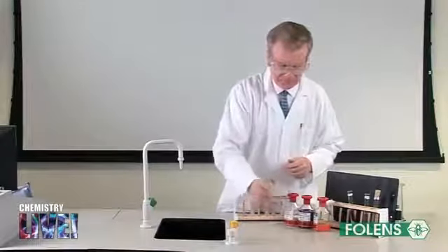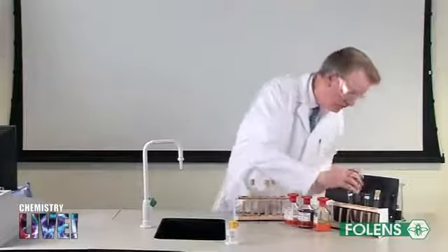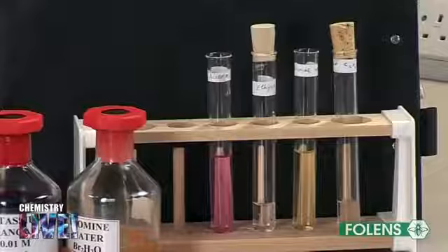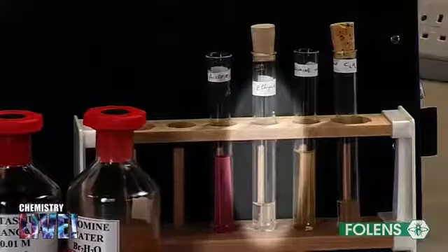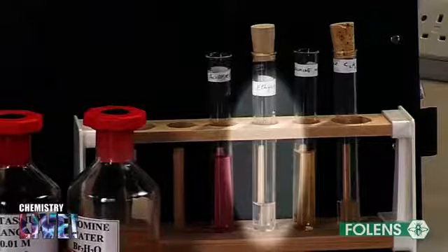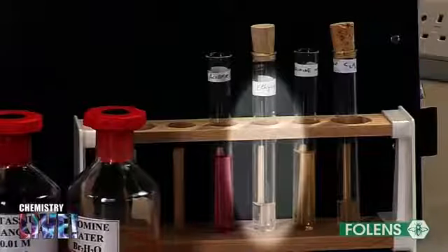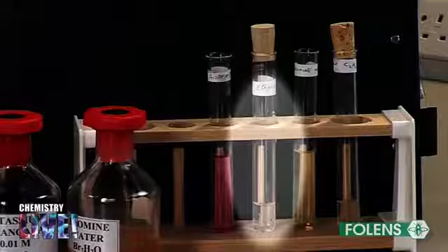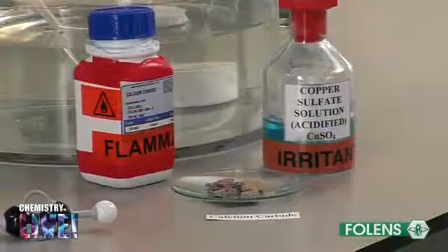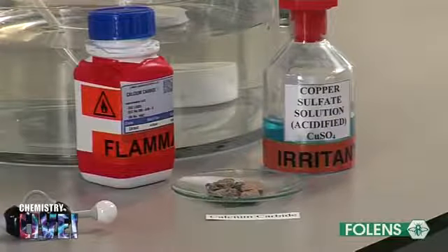Note that the purple colour disappears and a colourless solution is obtained. The very reactive carbon-carbon triple bond reacts readily with the potassium permanganate. You are not required to know the equation of this reaction or the names of the products for this course. Hence, it will not be discussed further. This concludes the study of the properties of ethine.